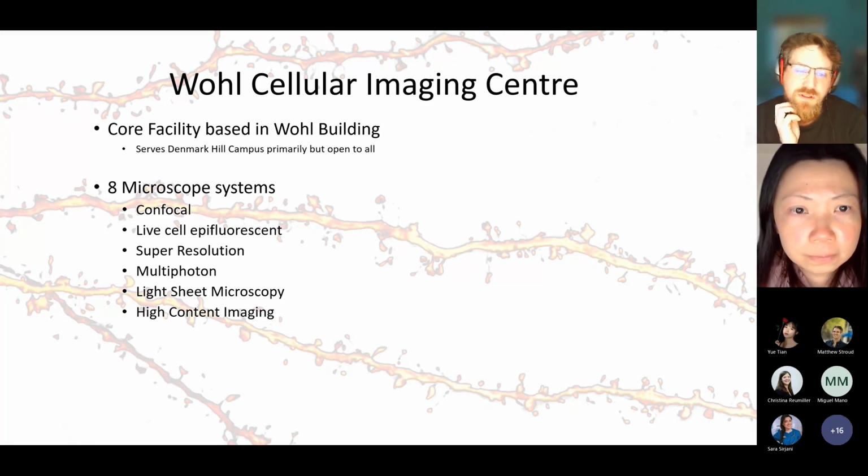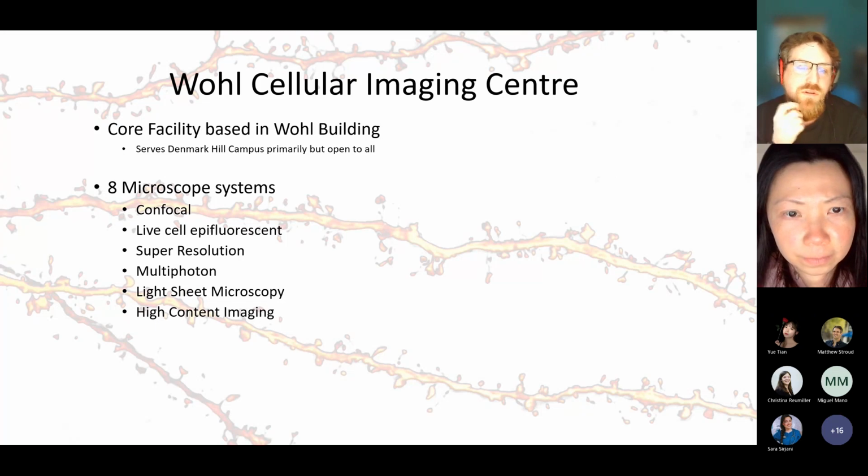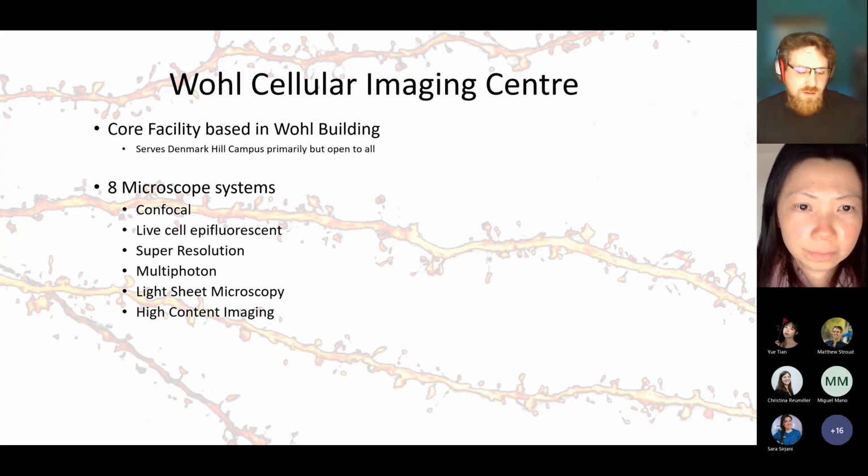The short summary to your answer is it's not as straightforward as normal staining, but as it's now a fairly well matured sort of imaging type, a lot of these questions have been broadly resolved, and they should now really just be aimed to be applied. I wouldn't go as far as to say it's very tricky, but there are things to do differently.